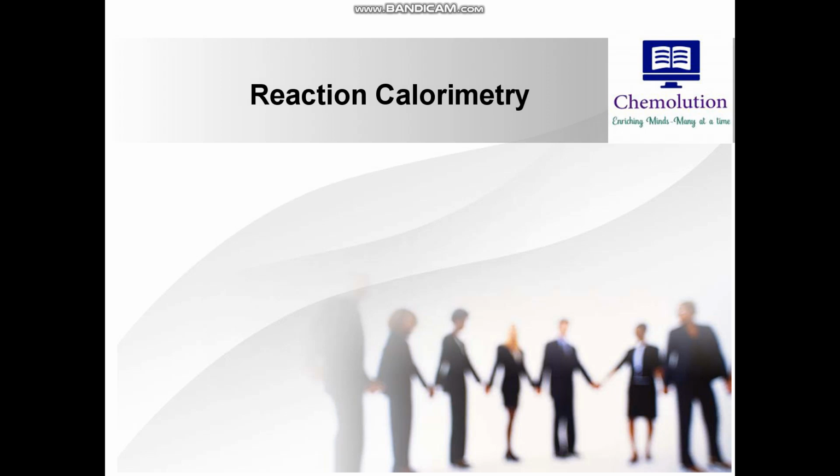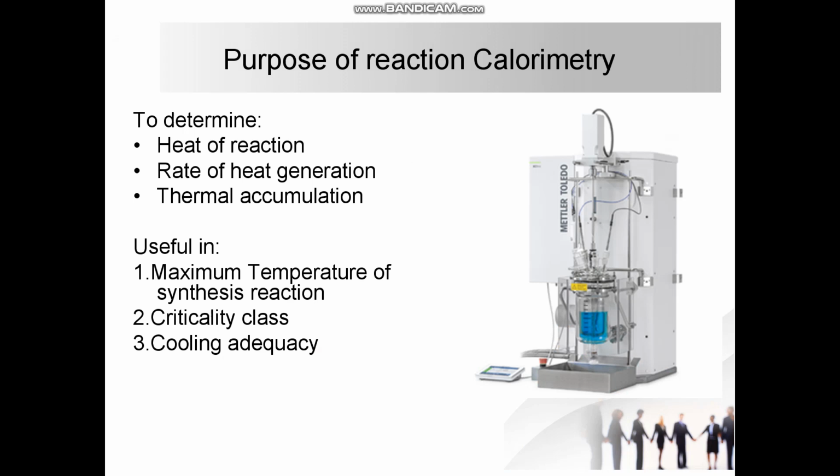Today's topic is reaction calorimetry and its application in terms of process safety. So, what is the purpose of reaction calorimetry? It is used to determine the heat of reaction, rate of heat generation, and thermal accumulation inside an exothermic reaction. It is useful in the determination of maximum temperature of synthesis reaction, criticality class, and adequacy of cooling required for the exothermic reaction.